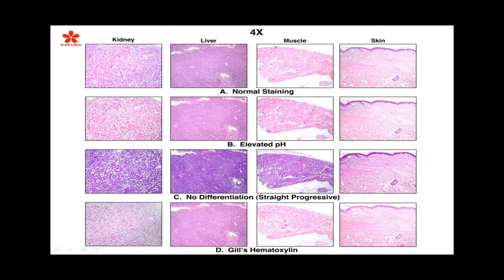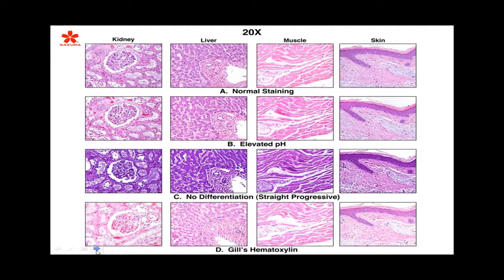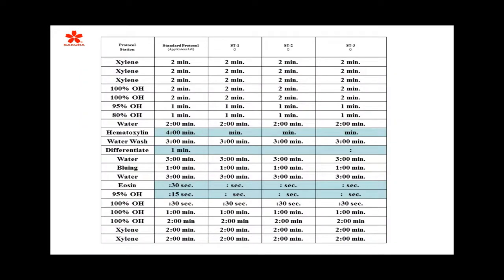You might say, well, this is too dark, and there's not enough contrast. But if that's what your pathologist prefers, then that's what we need to do, and that's what we need to maintain, whether we're doing 1 slide or 500 slides. So the next slide is another shot of multiple stains. You can see the different intensity again. We're going to be wrapping up now, but this is what I wanted to mention about how we go about optimizing the stains.